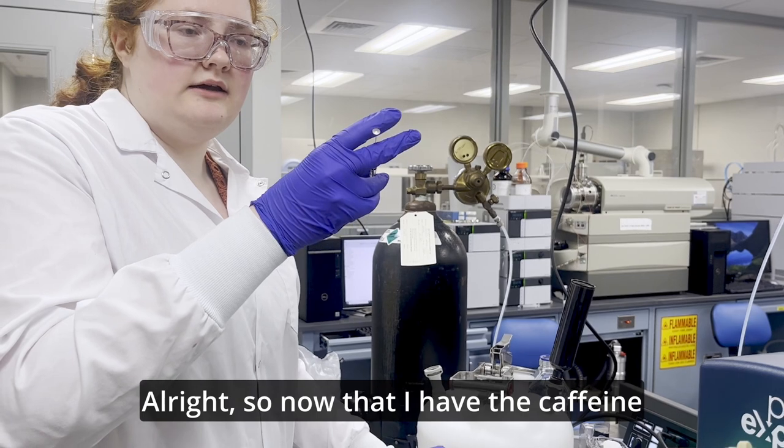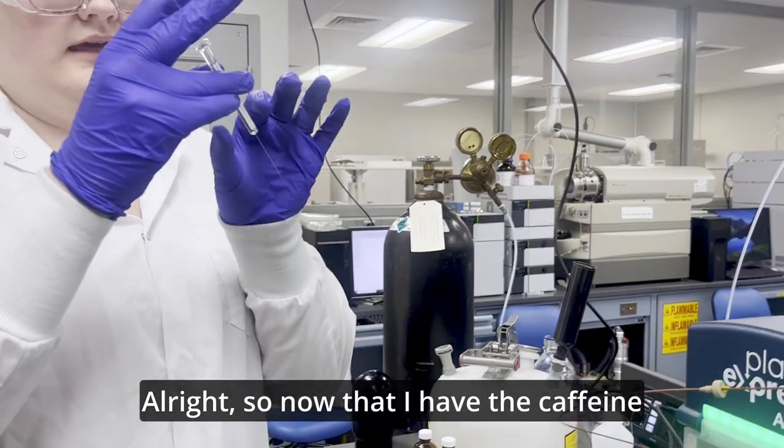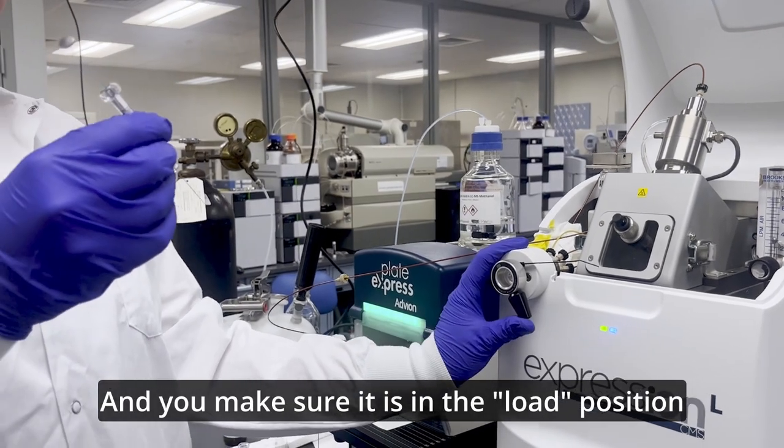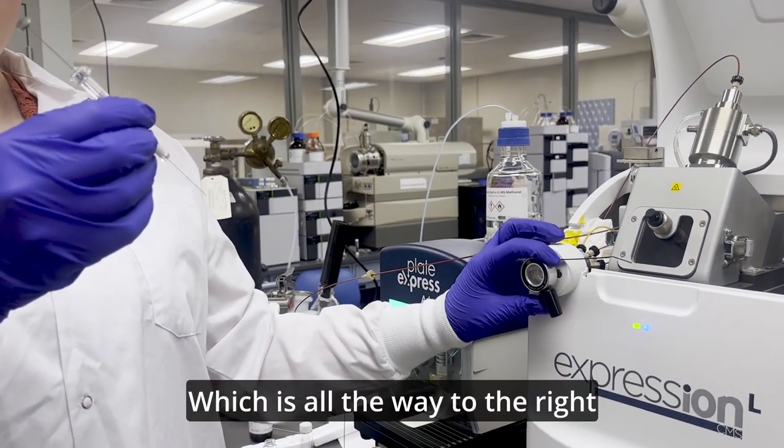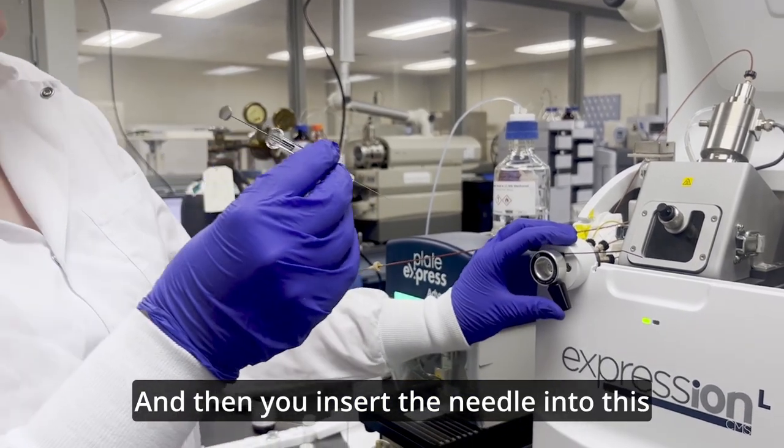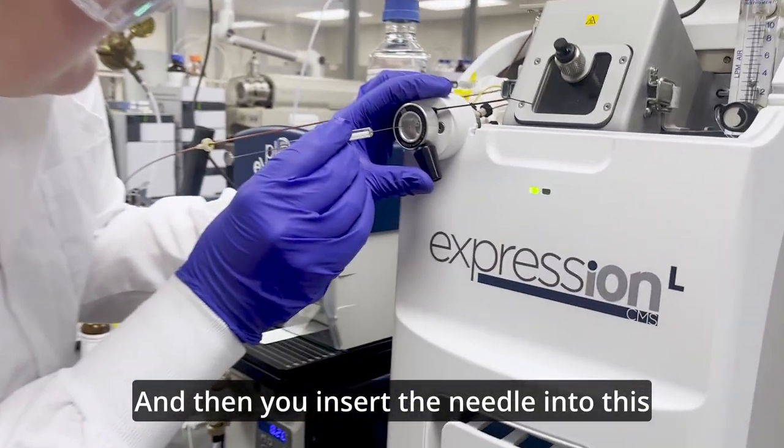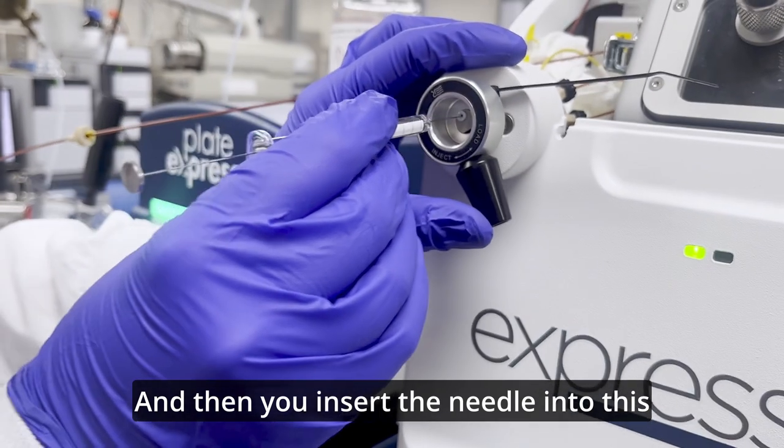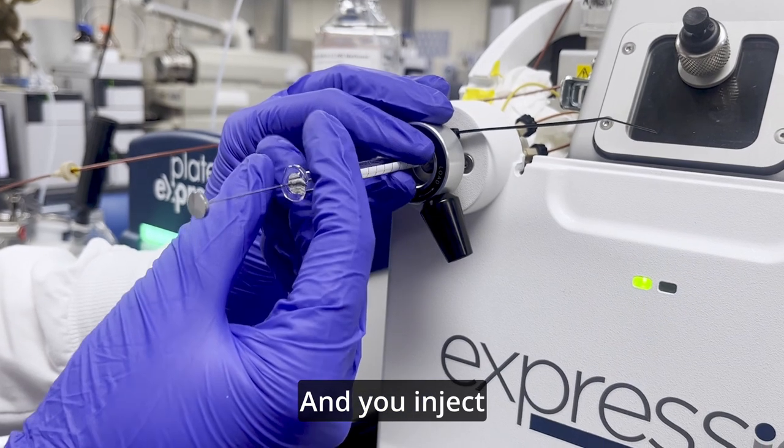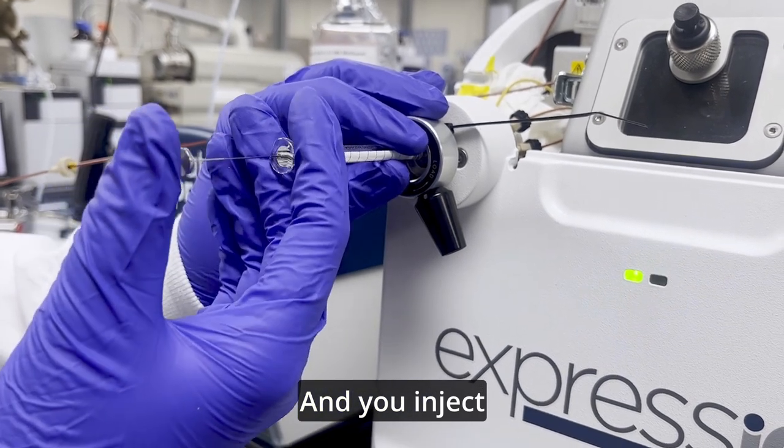So now that I have the caffeine, you go over here to the Reodyne valve and you make sure it is in the load position, which is all the way to the right. And then you insert the needle into this and you inject.